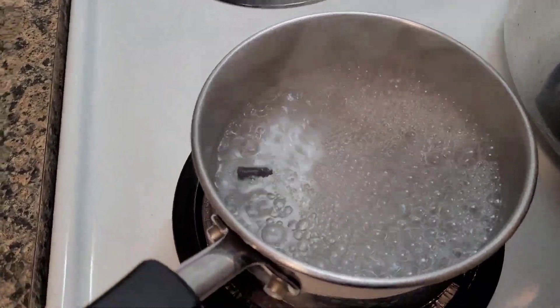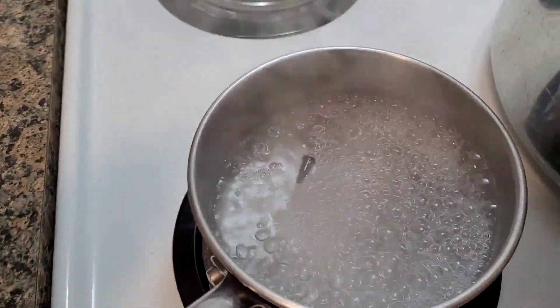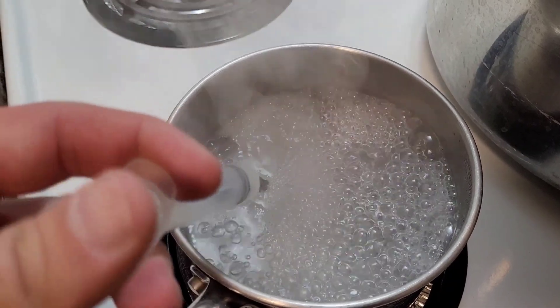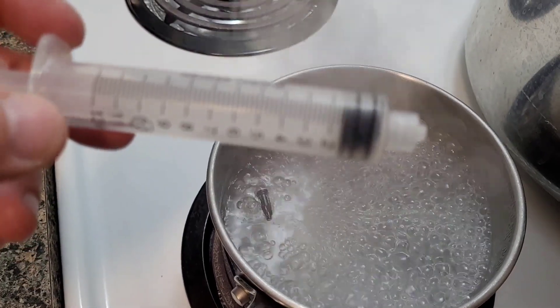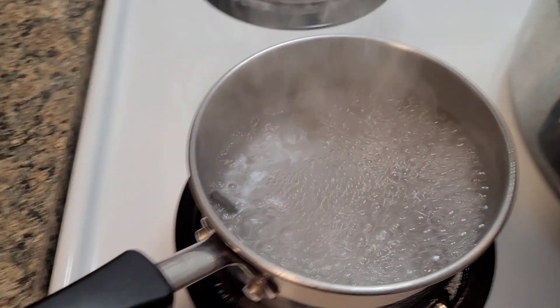Once it comes to a rolling boil, just let it run for 10 or 15 minutes, and then aspirate the boiling water in and out of the syringe a few times. That will give you a sterile syringe with sterile water inside of it.